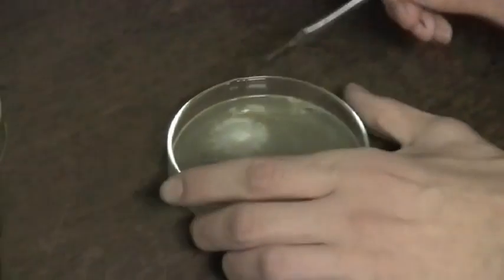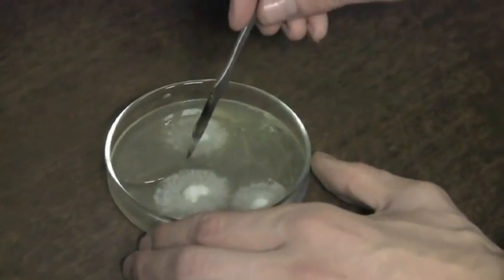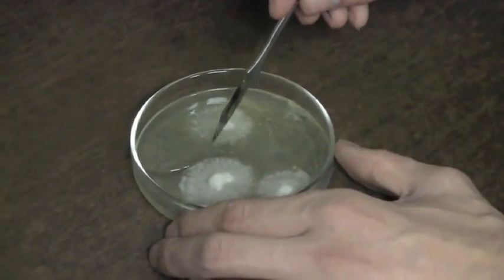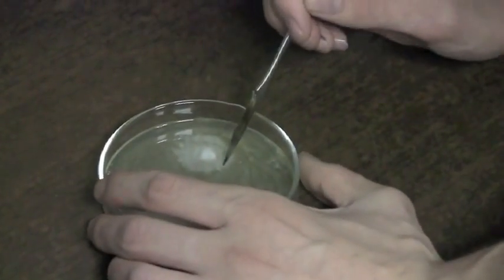This is a new process for us here. We've used a glass petri dish. We haven't done that before. And for some reason, the agar didn't really solidify in this dish. We don't know why. Might be the glass.